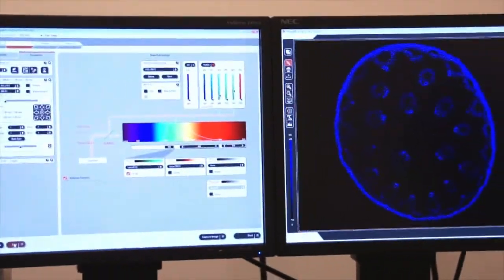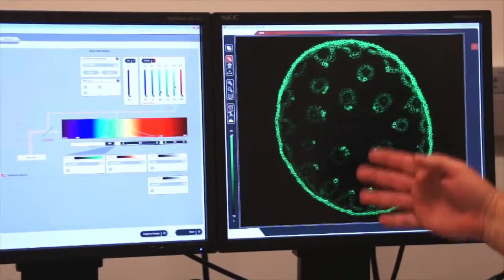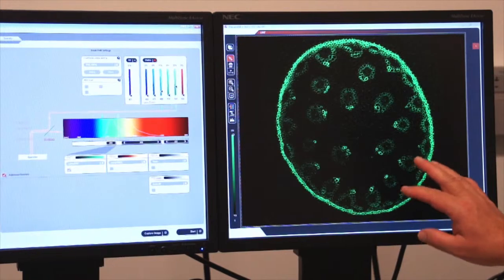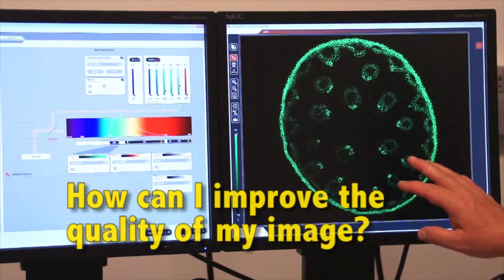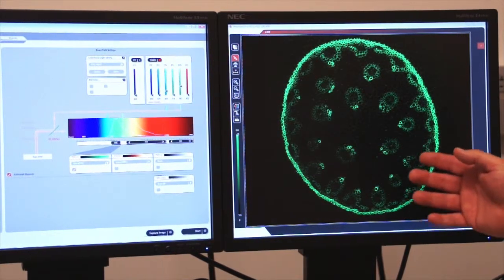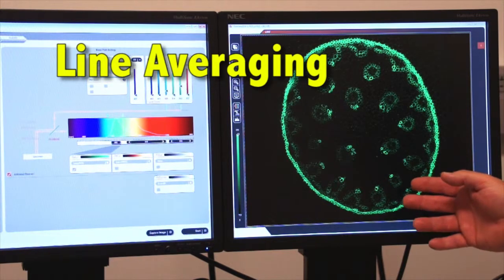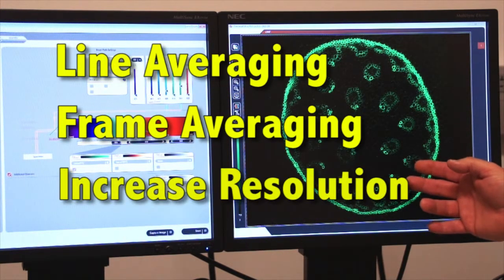Let's collect a live image on our screen. And as you can see, I have a fairly well illuminated image, but it's a little bit grainy. How can I improve the quality of my image? There are several ways to improve the quality of my image. One is to use line averaging. The other is to use frame averaging. And finally I can increase my resolution as well.